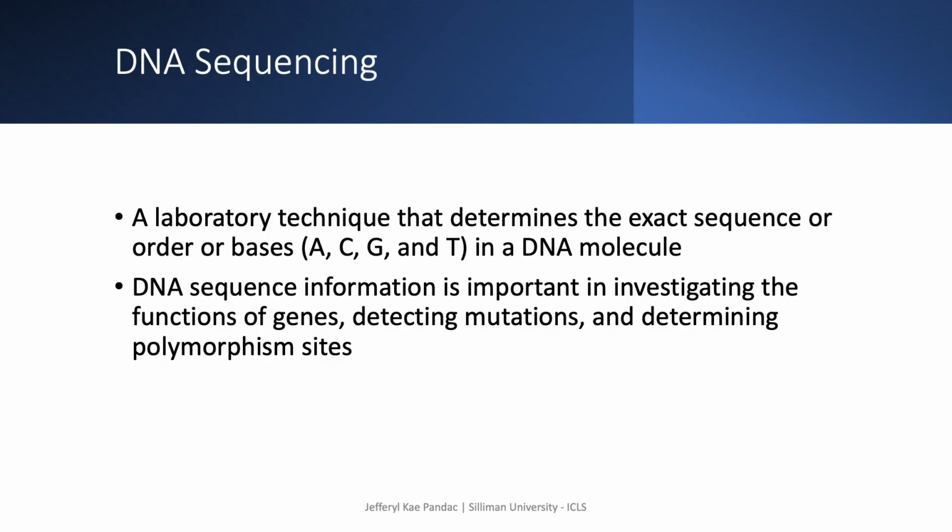DNA sequencing is a laboratory technique used to determine the exact sequence of bases in a DNA molecule. The DNA base sequence carries the information a cell needs to assemble protein and RNA molecules. DNA sequence information is important to scientists investigating the functions of genes.